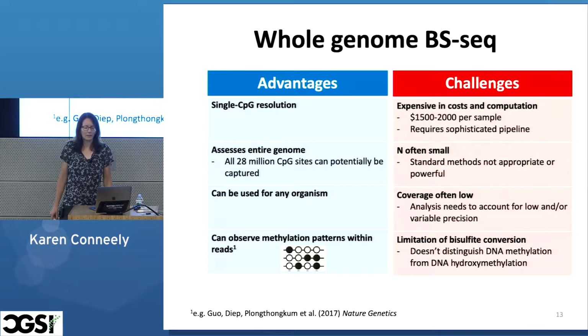And then a final limitation is the limitation of bisulfite conversion I mentioned before, where we may be estimating both methylation and hydroxymethylation. And that's an issue for another day. We're not going to really talk about that more today, but that is a concern with the bisulfite-based approaches.